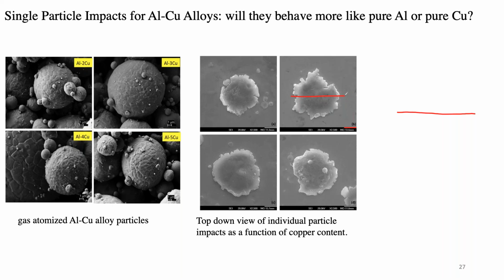Have you tried broad beam ion polishing at all for cross section? I have not, because I don't have a working broad beam ion polisher, but I would love to try that, and I think it could probably work really well. In a couple months, we're going to have a plasma FIB here, and I'm quite hopeful that it will allow us some added gains as well. But yes, I think broad beam ion polishing would be a great way to try.